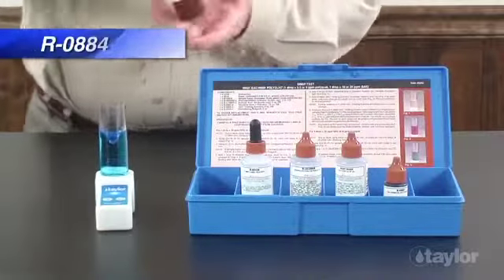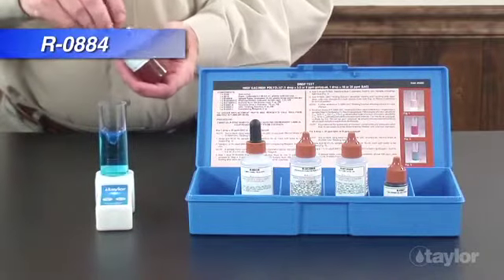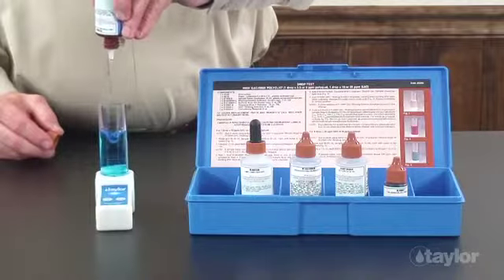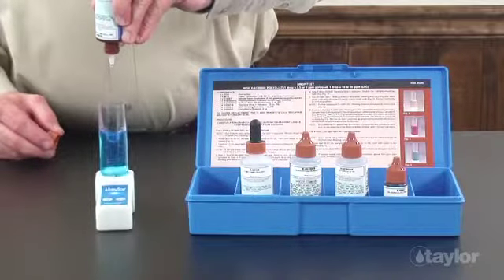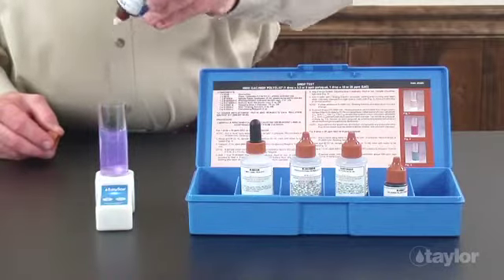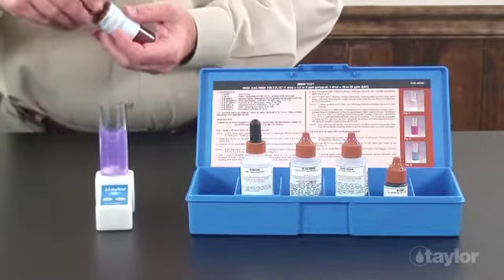Add the QAC titrating solution dropwise, swirling and counting after each drop, until color changes from light blue to a violet pink. Record the number of drops used. Note, further addition of QAC titrating solution should produce no color change.